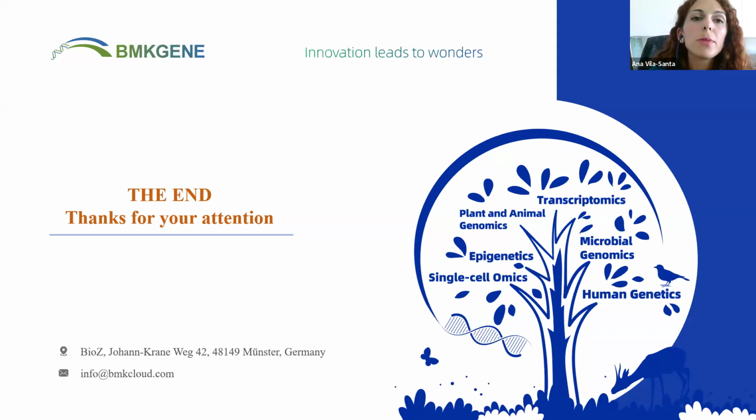Yeah, so when we have small samples, we actually advise to put more than one sample in the same block. The reason is, if the sample is very small and we just put one in the block and then we cut it, that means that only a very small portion of the section will be covered by tissue. And we advise that at least 40% of the section is covered by tissue. This is because if it's less than that, we basically have less RNA to capture.